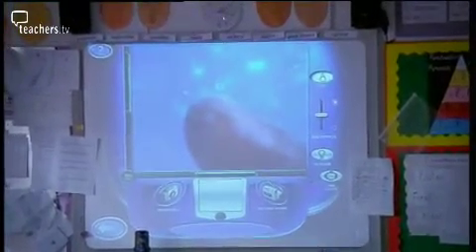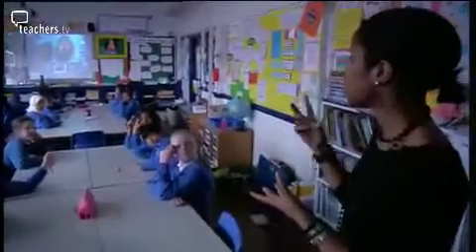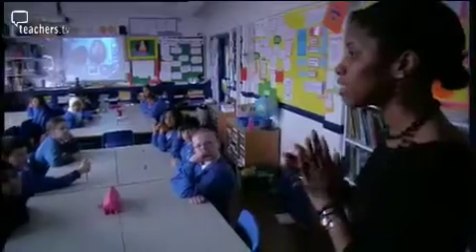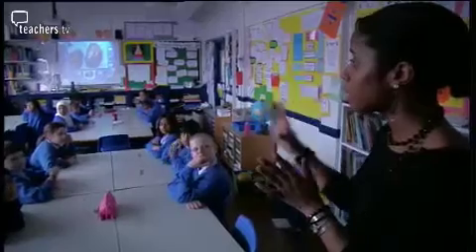Let's first of all have a look at these seeds under the microscope. Okay, that's been magnified 60 times, so it looks much bigger. The class will be able to explore life cycles by tracking the stages of growth as the seeds germinate. But also we want to think about how long we want to leave in between our snapshots.